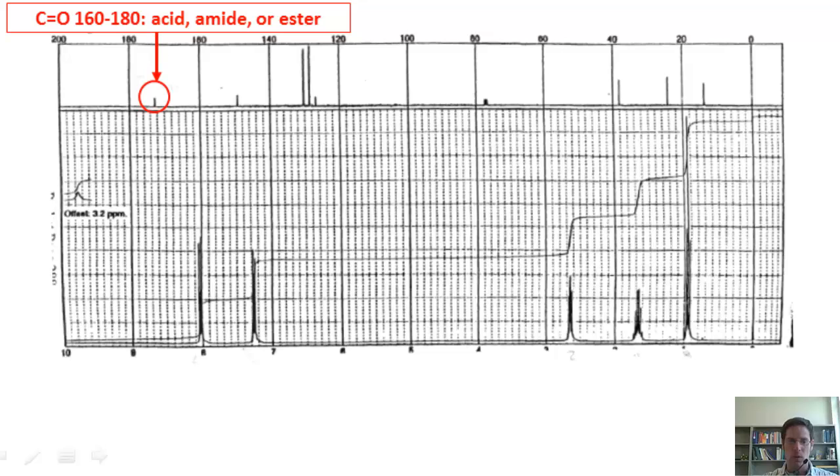I'm going to do my integrals. The smallest integral I'm going to measure with my little ruler and decide that looks like about 1 in height. I'm going to call however many millimeters that is 1. And proportionally, I'll measure from horizontal to horizontal each of the remaining integrals. Horizontal to horizontal is about twice the height of the integral over here, so this is 2. This one is also about the same, so it's 2. I also measure the remaining, and I find out 2 to 2 to 3.